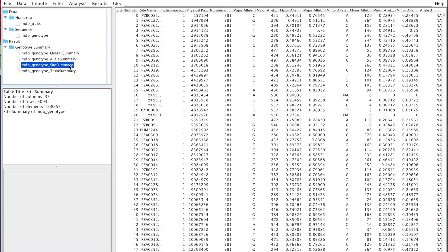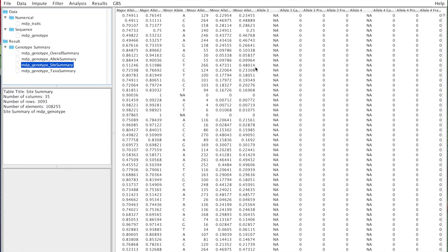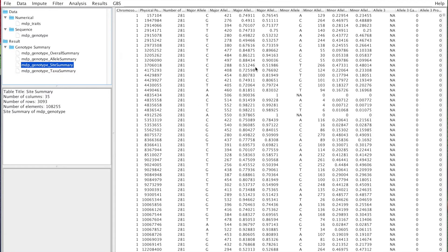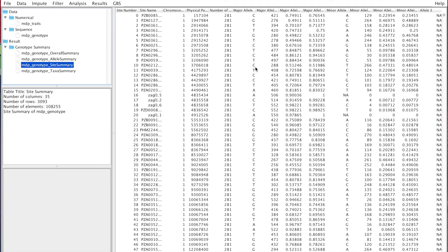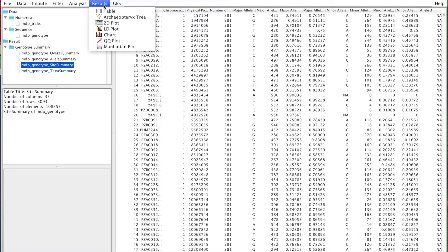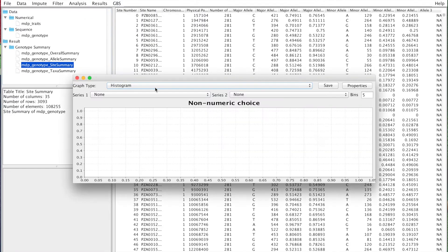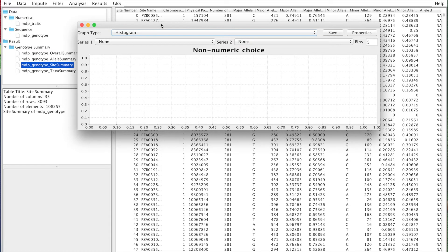Let's look now at this site summary. As you can see, it has a lot of values and things you can be looking at. Instead of looking at this table directly, what we can do is create a chart. We're going to go to Results and Chart. Here we can create histograms.